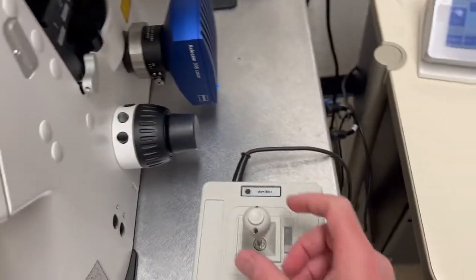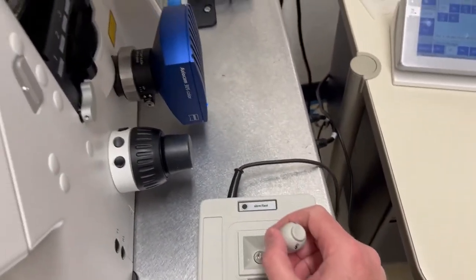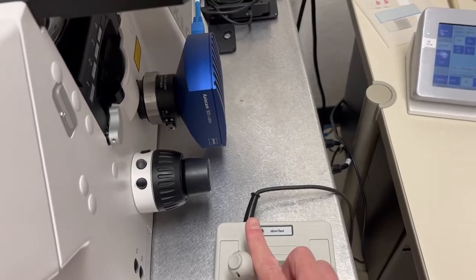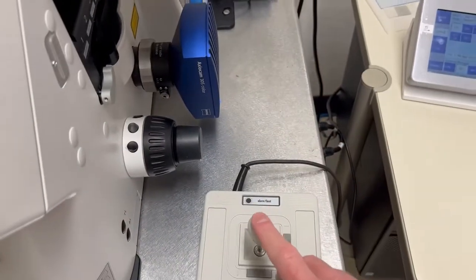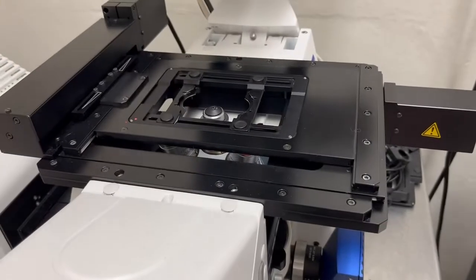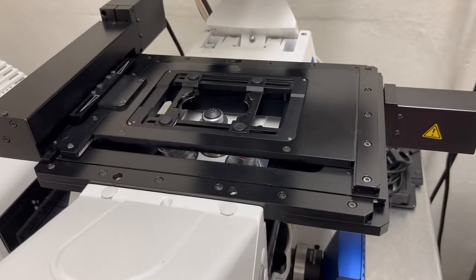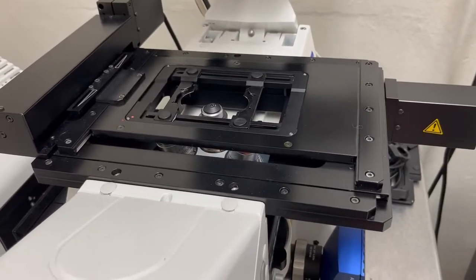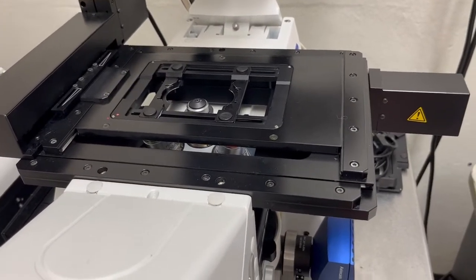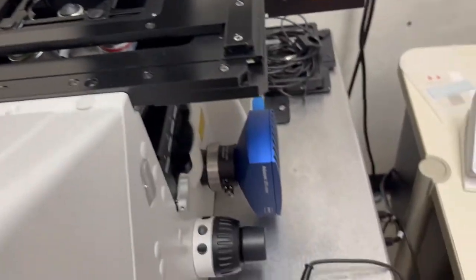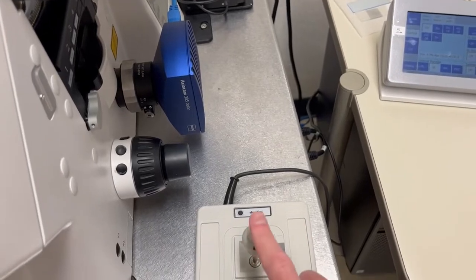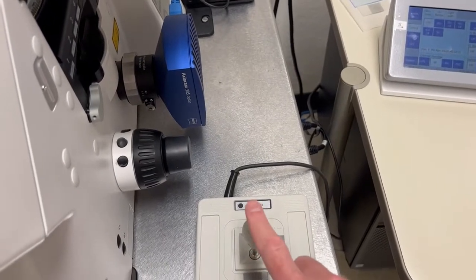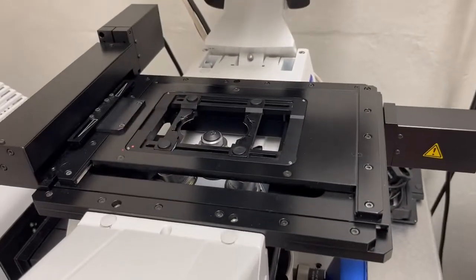So you can see if I move this, you're hearing a sound. That's the stage moving. If I press the button and move it again, you can see that it's much slower, and that's because it was on fast and now it's on slow again. This is a toggle, so if I toggle back, I go back to fast.